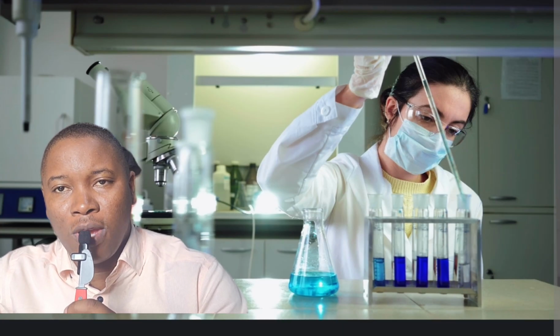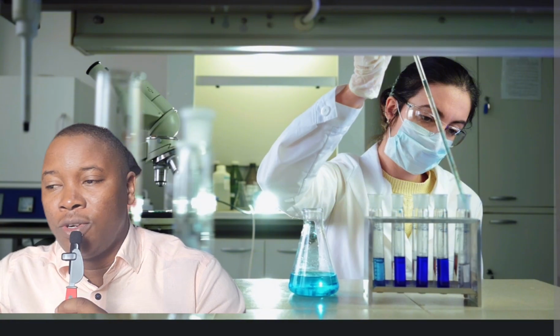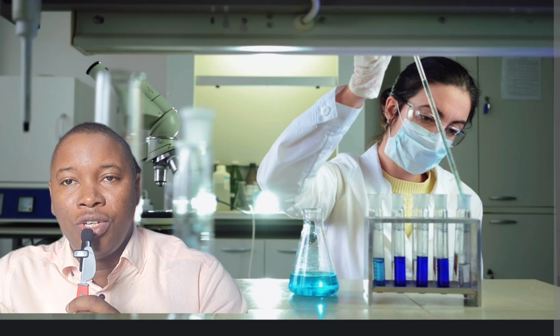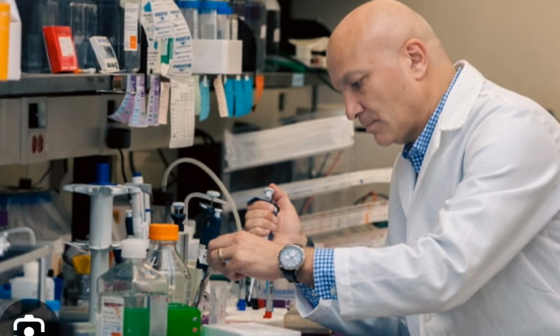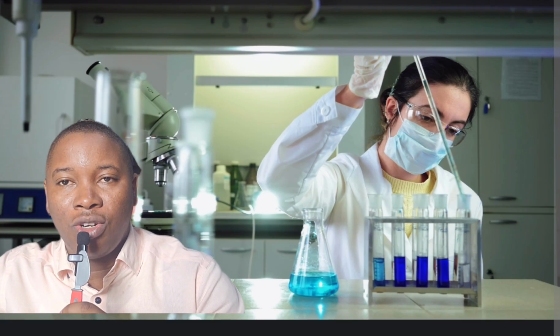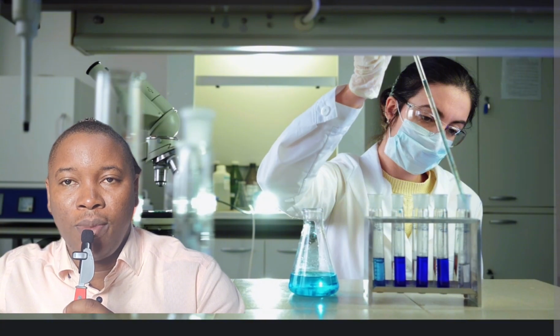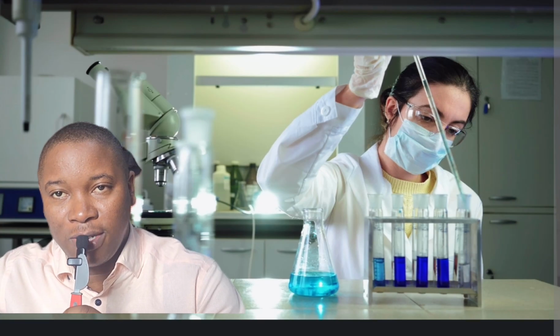You have a process where you prepare a tryptone broth, and then you inoculate it with the bacteria of interest. When you have the bacteria in the broth, the bacteria function to break down tryptophan into indole, pyruvate, and ammonia. When this reaction occurs, we may not be able to detect whether this bacteria has been able to break down the tryptophan present in the broth or not.